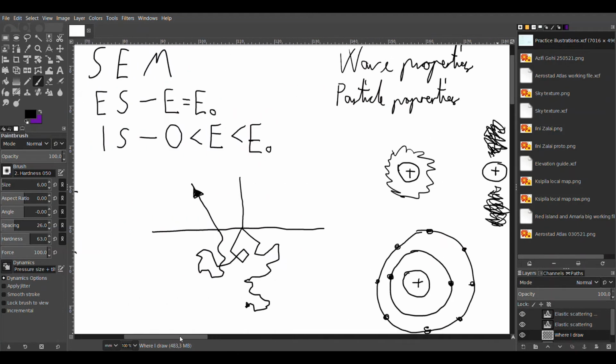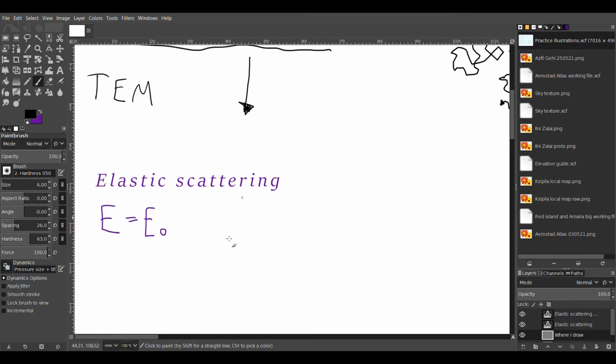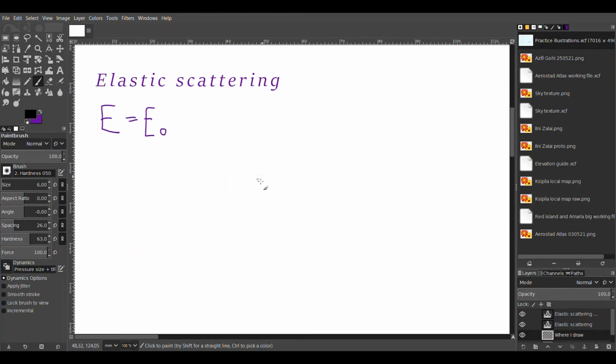Yeah, and so to be able to be detected, so here's the beam. So the detector grows like, remind me that I'm bad at drawing. So the detector kind of is divided into 4 parts and covers mostly up here. So it can have other configurations, of course.